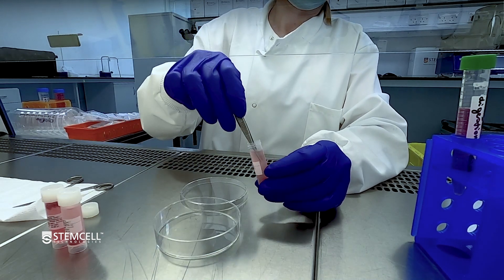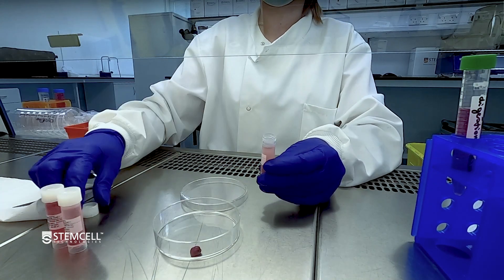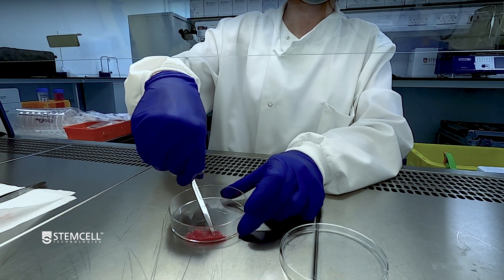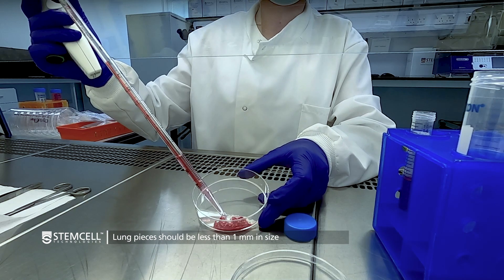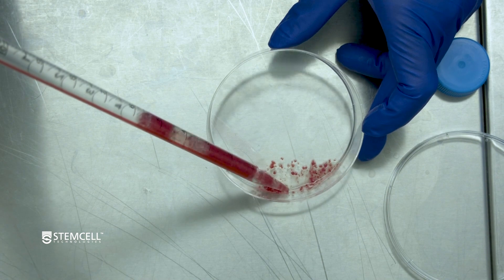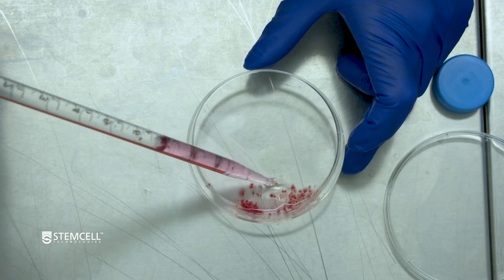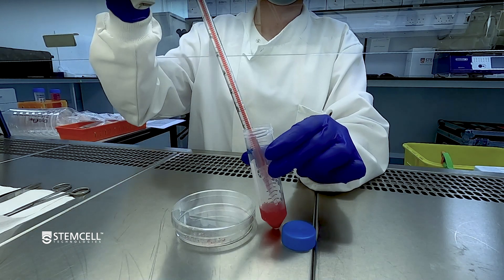Transfer freshly harvested lungs to a sterile treated tissue culture dish. Mince the lung tissue into a homogeneous paste using dissection scissors and forceps. Add 5 ml of the digestion medium to the dish and gently mix. Transfer the minced tissue and the dissociation medium to a sterile tube. Rinse the dish with the remaining 5 ml of digestion medium and add it to the tube with minced tissue.